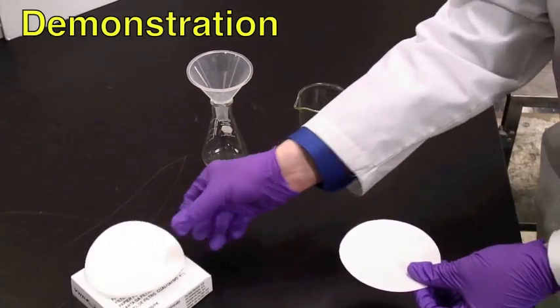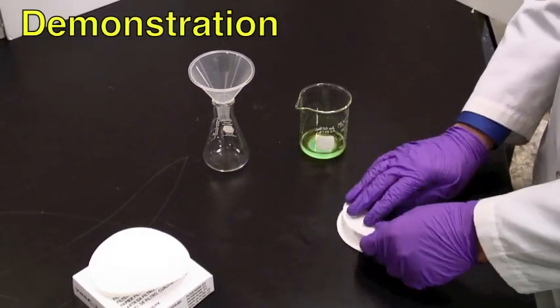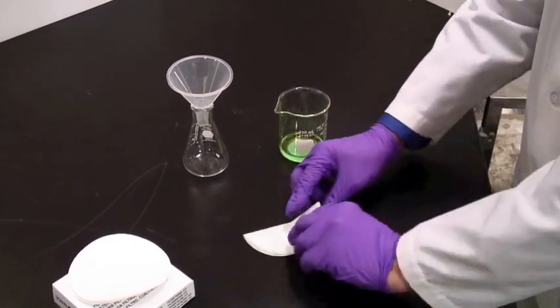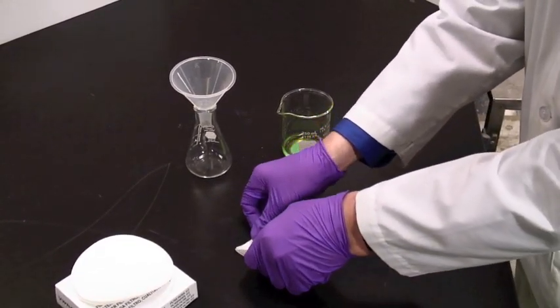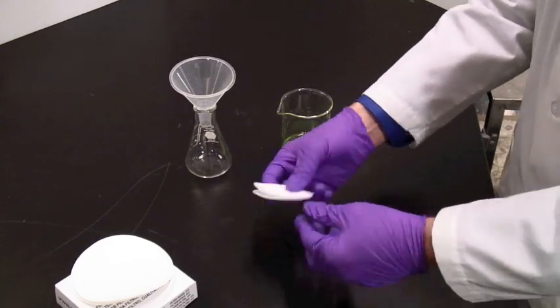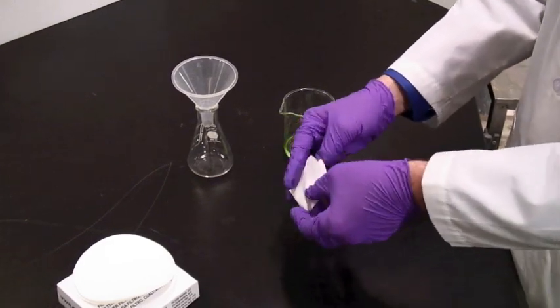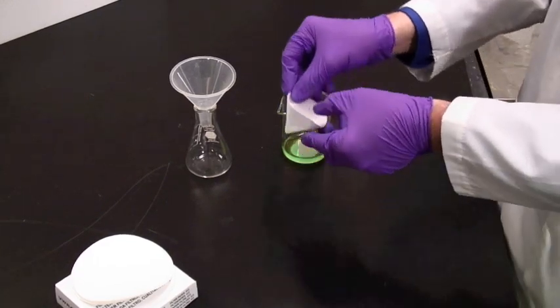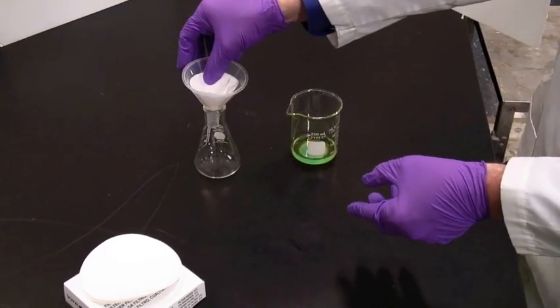Filter papers are circular. Fold it in half, and then in half again. Take this quarter circle and open it with three on one side and one on the other, and you have a small cone, and that fits into the funnel.